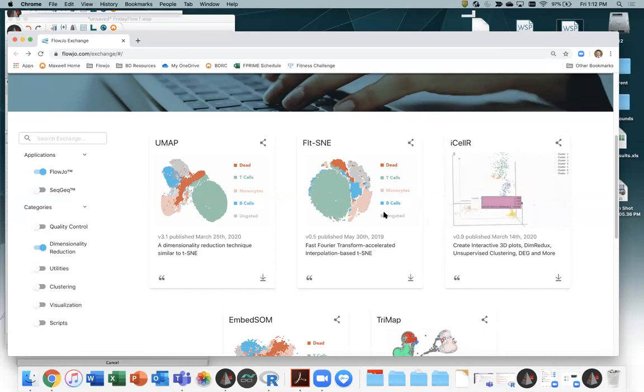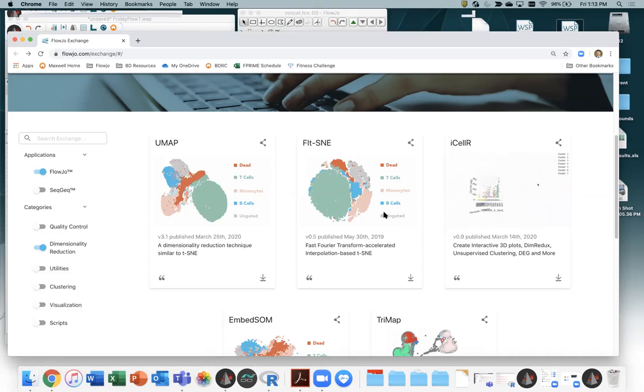Principal component analysis, PCA, is probably the most famous throughout the world, not speaking flow cytometry specifically, in that it produces a reduced, two-dimensional representation of your data that tries to maximize just differences, specifically variance between your data points. And so that's used in a lot of places to summarize data. It wasn't particularly useful in flow cytometry because it requires the data to be linearly separable. And so t-SNE actually took an iterative approach that is going to just try to map any kind of data, whether it's linearly separable or not, down from a high D space to a low D space.